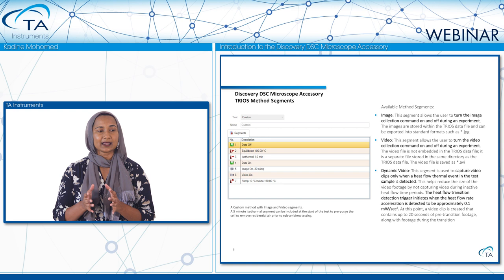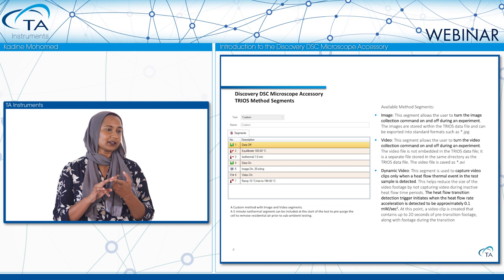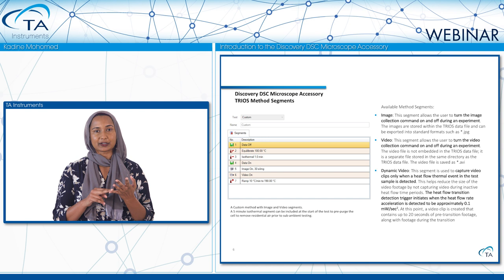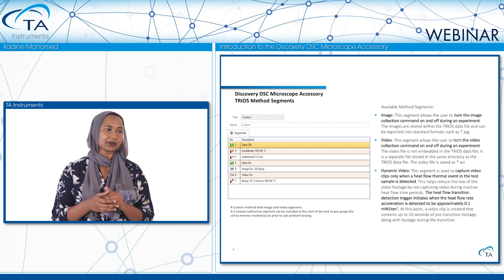Looking at the method segments for a particular experiment: we start with data storage off, ramp at equal rate to 100 degrees, isothermal for one minute, data storage on, and then image and video collection before beginning the temperature ramp. In this method, we're collecting images and video from 100 degrees to 190 degrees over that time scale.